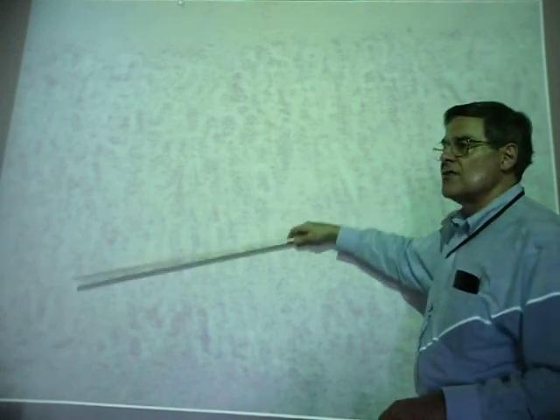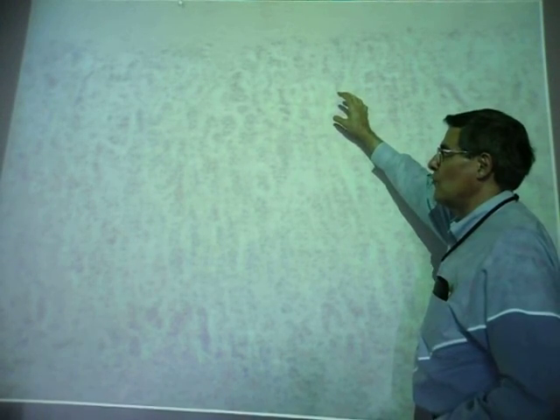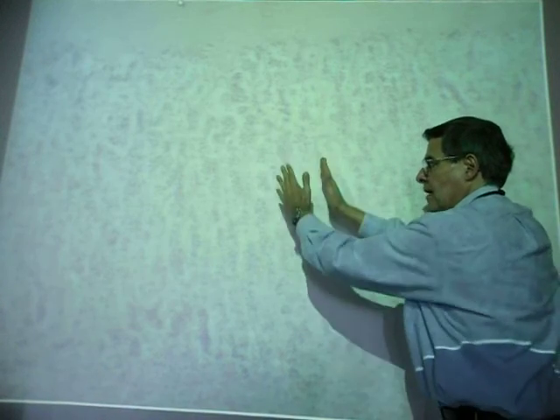So this is called the zona fasciculata, the middle region of the adrenal cortex. So zona glomerulosa up here, where the cells are in clumps, clusters, kind of round oval. Here they're in parallel bundles, the zona fasciculata.